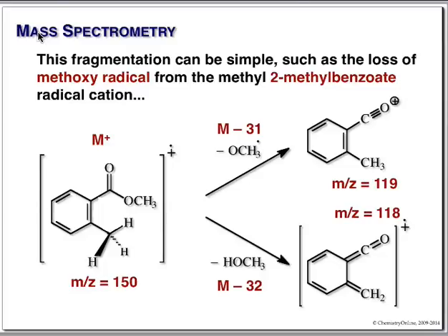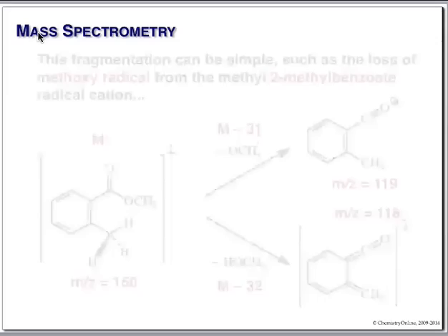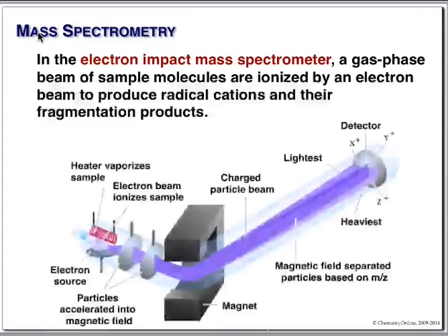Most of the fragmentations we're going to look at are going to be simpler than this. We're going to lose things like a methyl group that weighs 15. We're going to lose a halogen, etc. Nice, simple, straightforward things. The mass spec kind of looks like this.